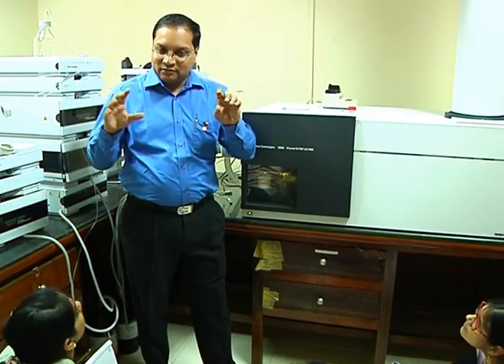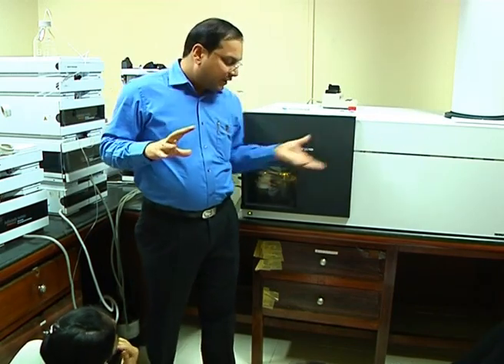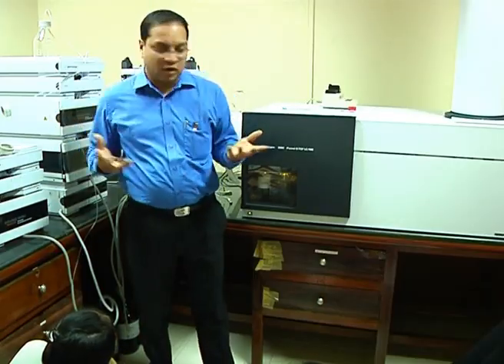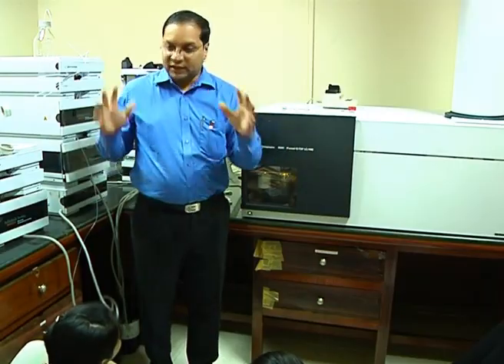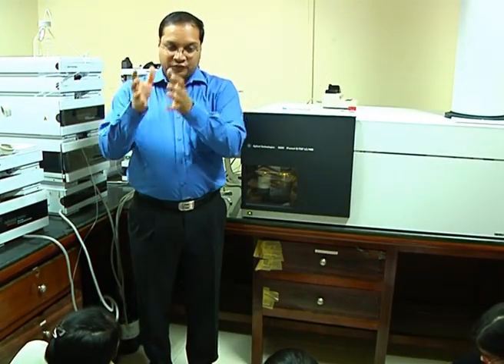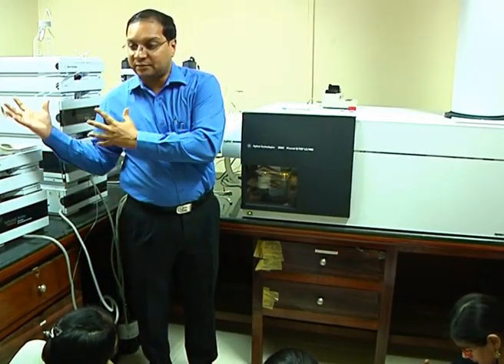They are in tandem, with MSMS in between. If there are two different analyzers, like here, quadrupole and time of flight, then it is also called a hybrid mass analyzer, because quadrupole in itself is a mass analyzer, and time of flight in itself is a mass analyzer. Two different mass analyzers coupled with the functionality of MSMS become a hybrid mass analyzer, or hybrid tandem MSMS.